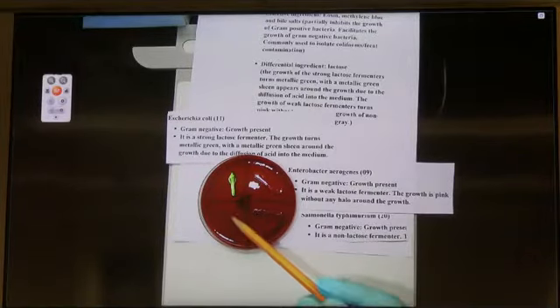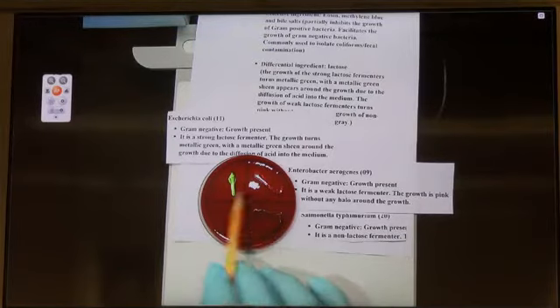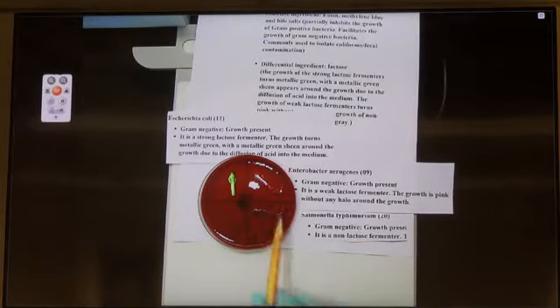And number 24 right here. This one is 23. As compared to the others, you can hardly see any growth. On a scale of maybe 1 to 10, how many numbers would you assign these 3 bacteria? 8 maybe?